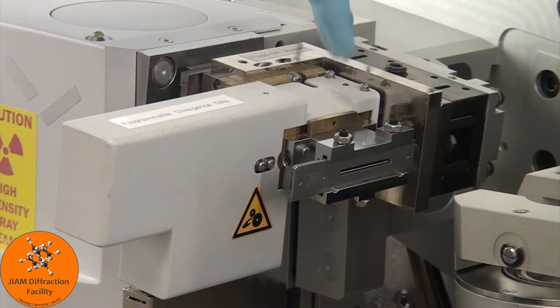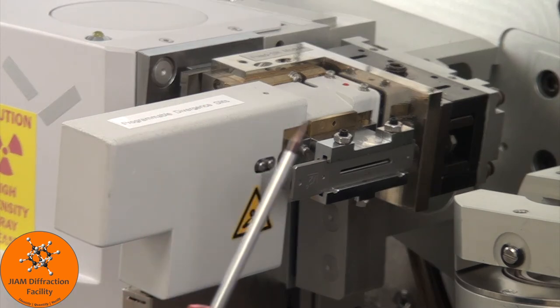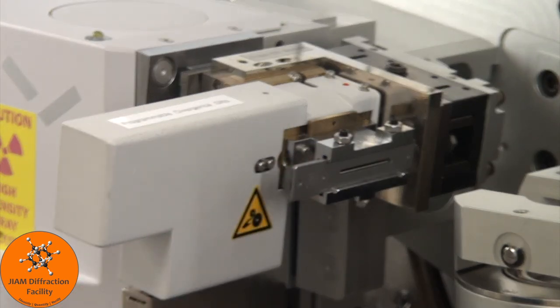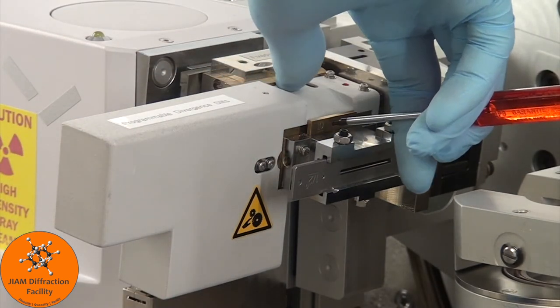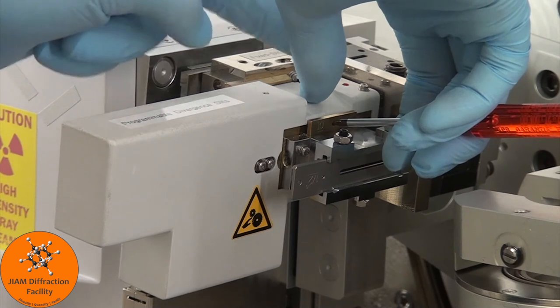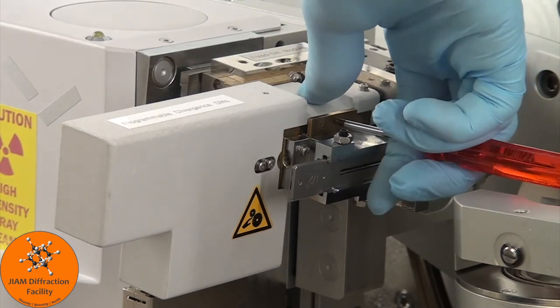Next, we have the mask, shown here, which controls the width of the sample that is irradiated. Width is defined as the direction from the front of the chamber to the back. If you need to change the mask, we have this small tool located in the bottom of the chamber. All you need to do is insert the tool into the small hole at the top of the mask. I like to place my thumb here in order to prevent the mask from flying out, and then simply lift the mask out.